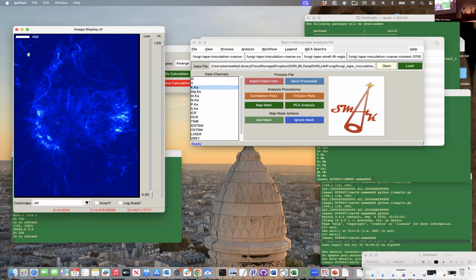Okay, that makes sense. And the same thing if you go from 1 micron. When I went from 1 micron to 15 microns of the optical image, it's downsampling that in a bicubic way too.